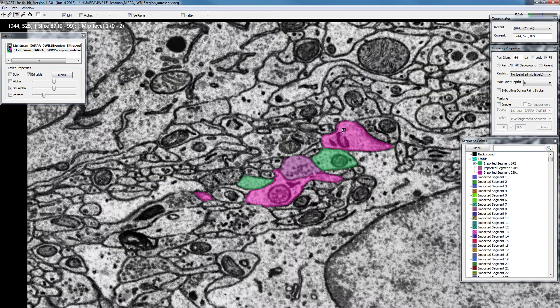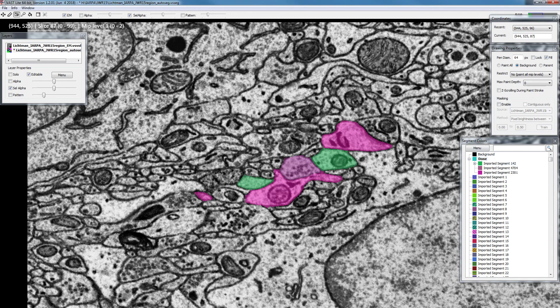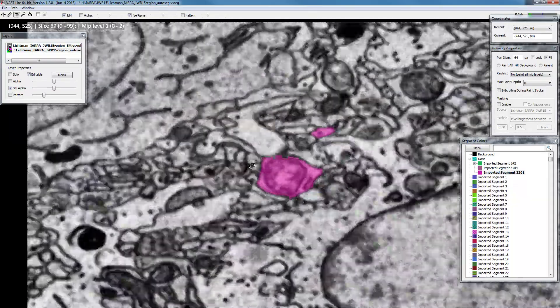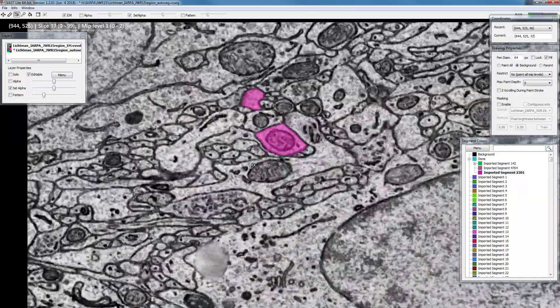Next, let's take this object — it looks like a spiny dendrite and it's a larger object. To isolate it, I just select this object. Now you don't see the other labeled things anymore. If the done folder is selected, everything inside that folder is shown. If I select this specific object, nothing else is shown because this doesn't have any children yet. So now I have to check whether this is all correct.